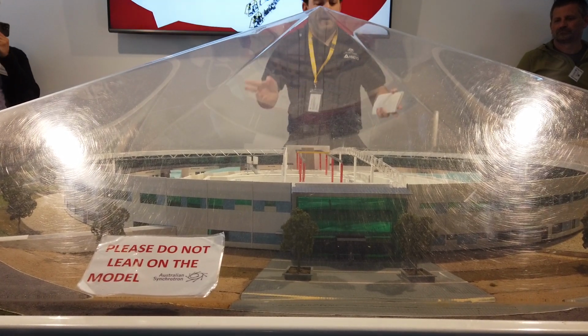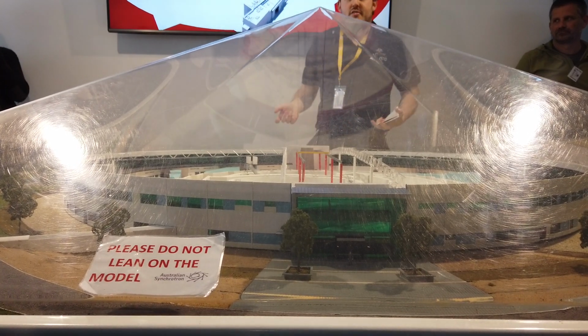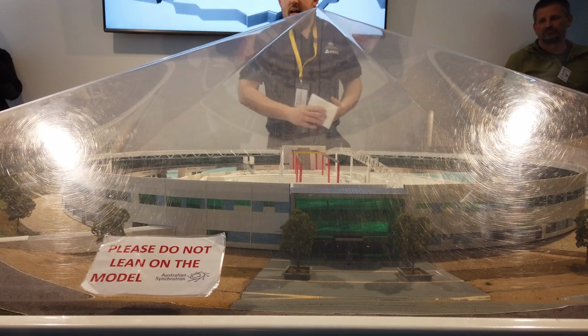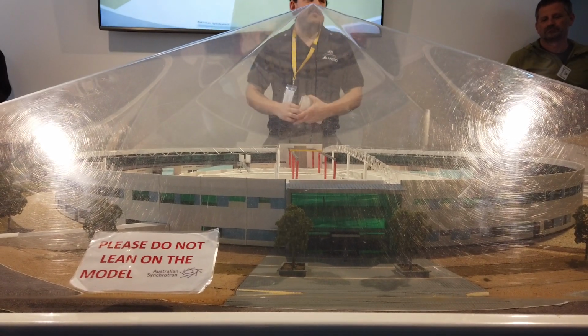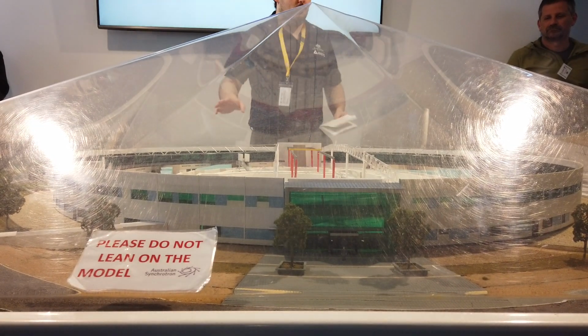The yellow magnets are our bending magnets. As they turn, they have to give off energy. That energy is in the form of photons, the light that we use at the synchrotron to conduct our experiments every day of the week. As they go around our smaller ring, our booster ring, they actually are able to do 2.4 million laps a second, and then we pass them to our larger ring, our storage ring.